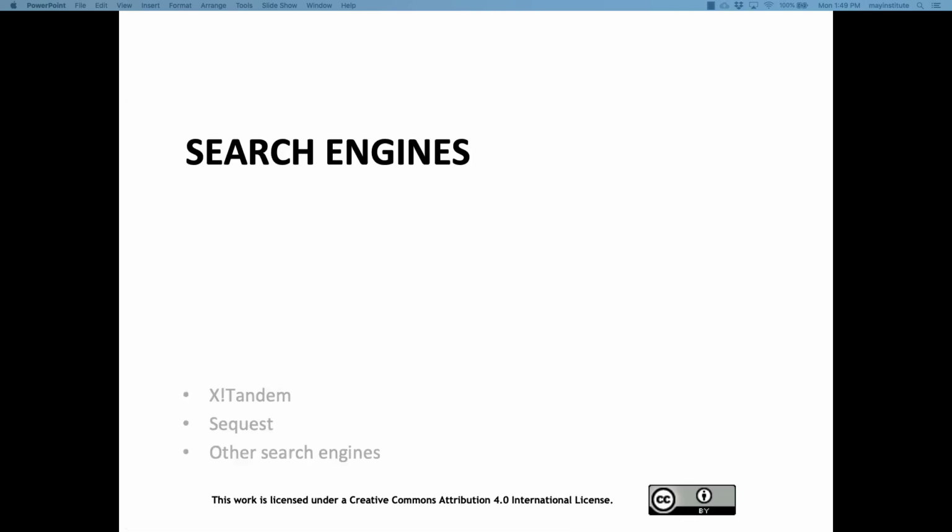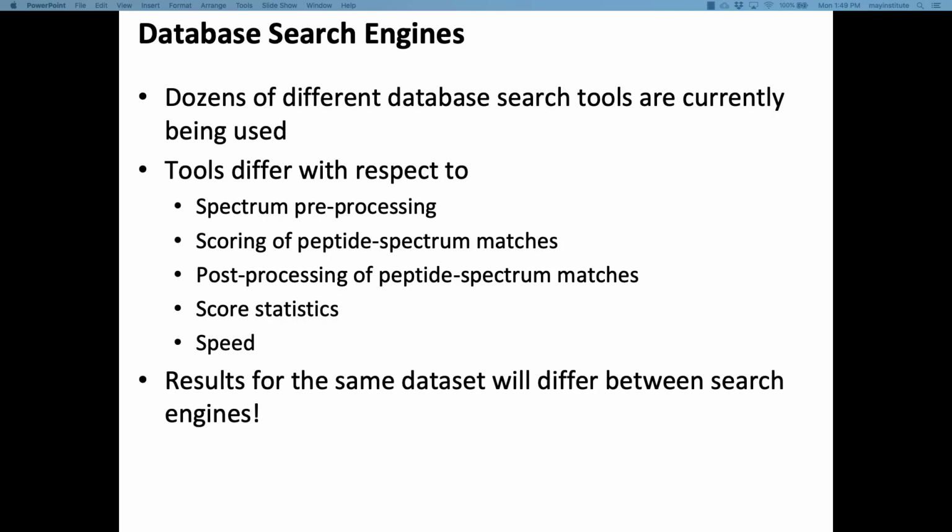Now let's look a bit into some of these search engines, and I'll only give you glimpses into that, because we're taking away too much time from the hands-on session. There are a lot of database tools that are currently being used, and they come into fashion and move out of fashion at a certain rate. Some have been with us for a long time. With some, we don't even know what they're doing, particularly with the commercial search engines. There's perhaps a paper out there, but the only thing that you can guarantee is that this paper no longer describes what the search engine does.